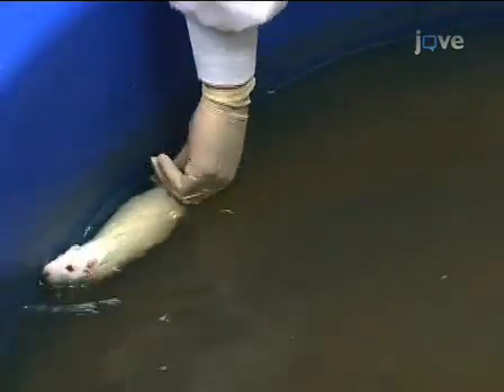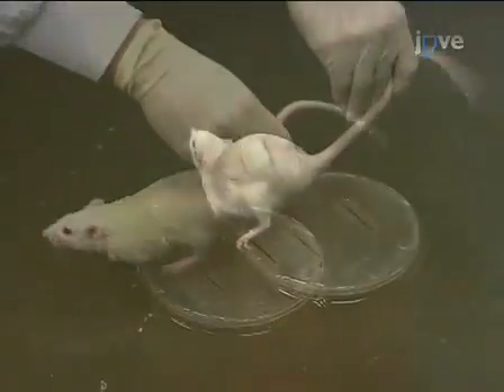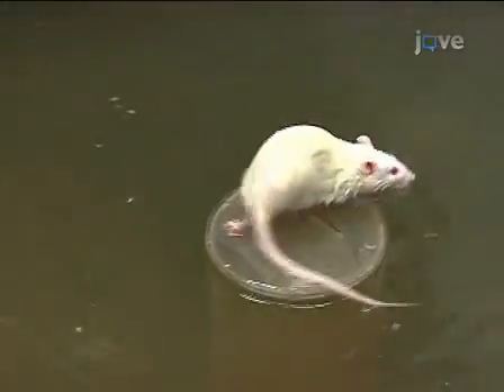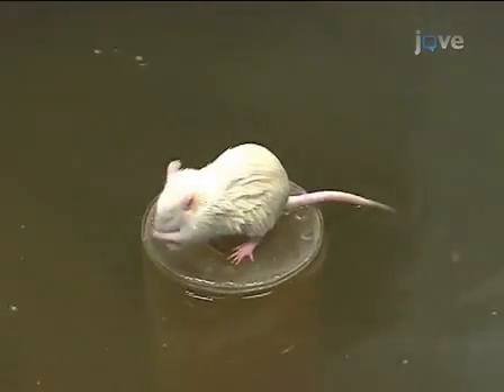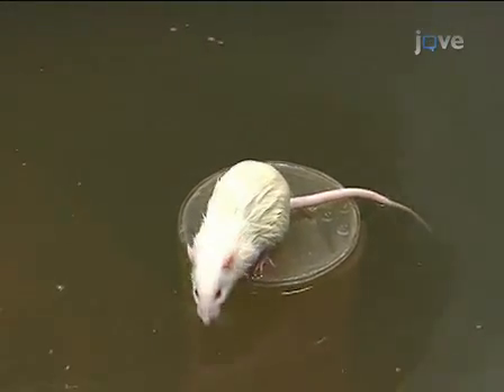Repeat the same procedure for two more trials, starting at a different location for each. Once the animal has completed all three trials, dry it off with a towel. Repeat the three-trial training process for all the animals. Keep the directions the same for all of them and record their times.